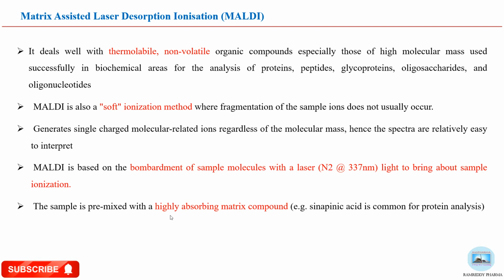In this, our sample is pre-mixed with the absorbing matrix compound. Initially we are mixing our molecule with the matrix, so around our compound the matrix is coated.